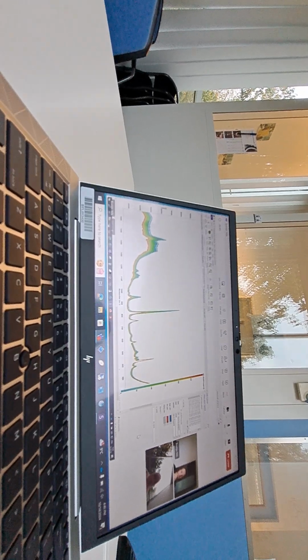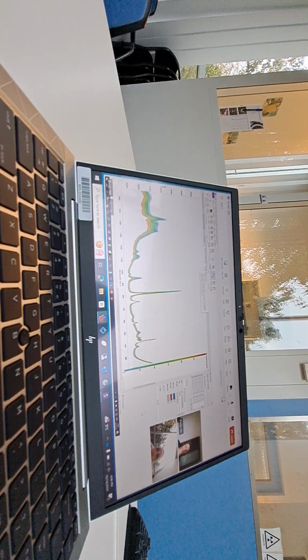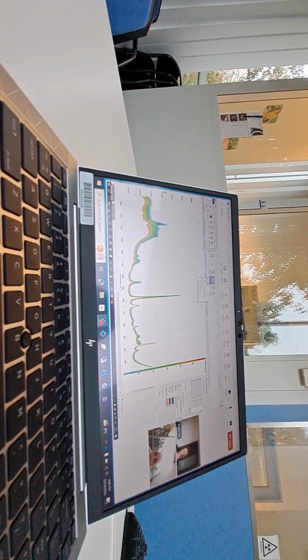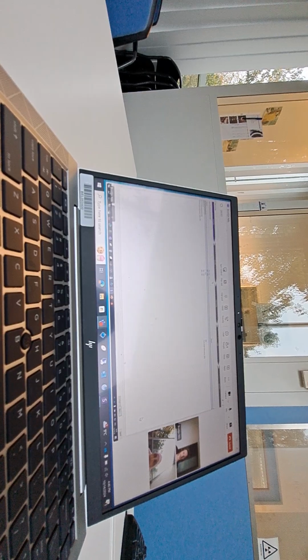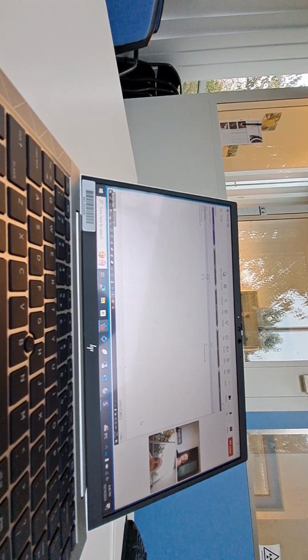In terms of pre-processing, if you go to data, here pre-processing. I think you can also just click on it here or pre-processing here. You select your data set.